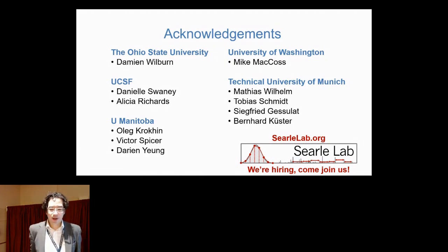That's a great question. We explored a bunch of these different types of architectures to make decisions on it. One of the issues with this type of data is that you want to look at adjacency: how much do adjacent amino acids affect other amino acids? We find that is the most important characteristic, and that's why having that convolution slide across is the best way to think of it.